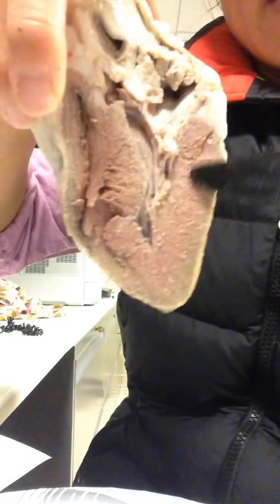Okay, and then, let's see, papillary muscle. The papillary muscle is right here. That is the papillary muscle. And then the last one is the pulmonary semilunar valve.